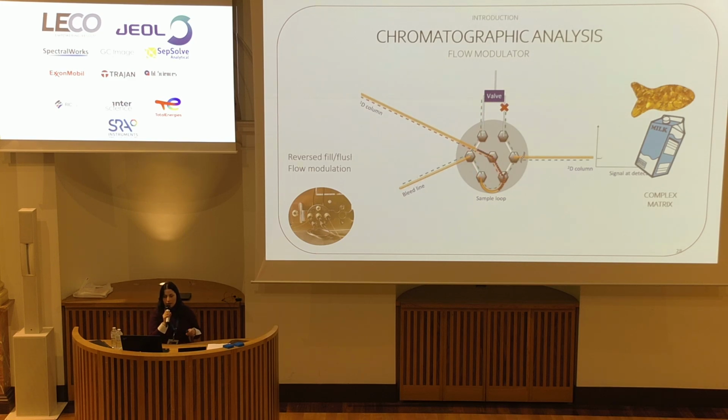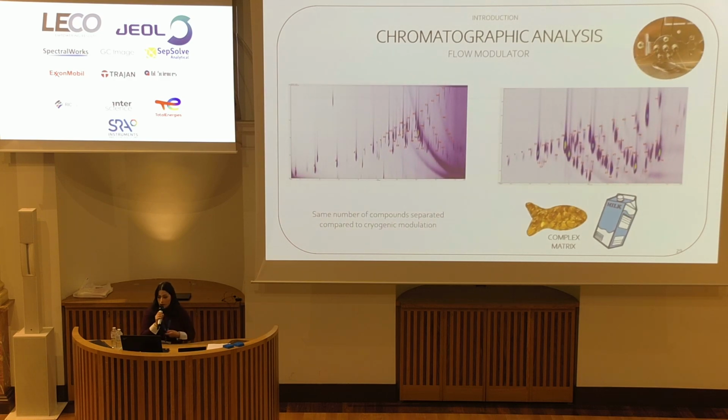Also, with this modulator, we don't have a volatility restriction. So basically, volatile compounds can be modulated as efficiently as semi-volatiles. And also, we can have the same number of compounds separated as with a cryogenic modulator.